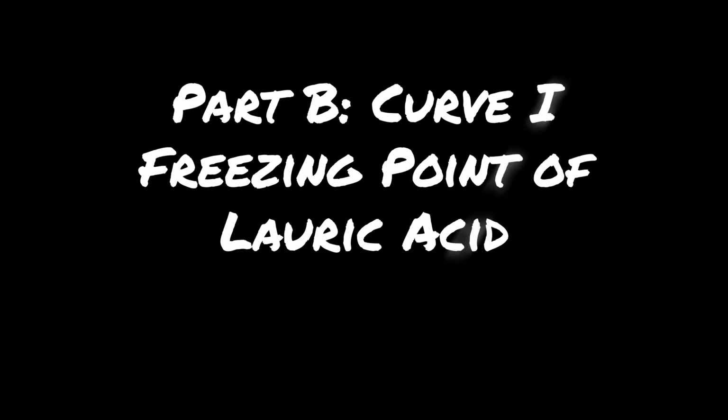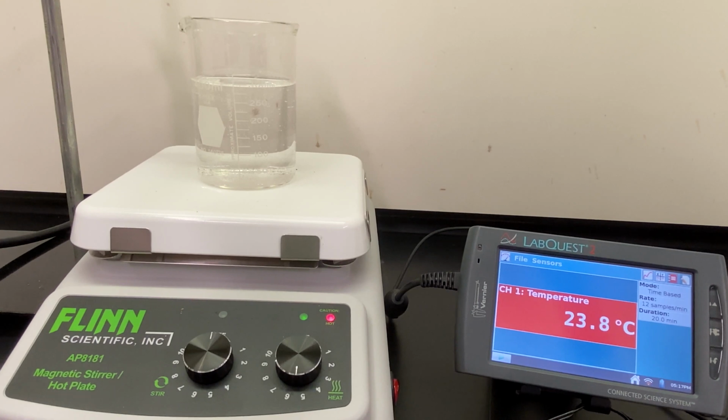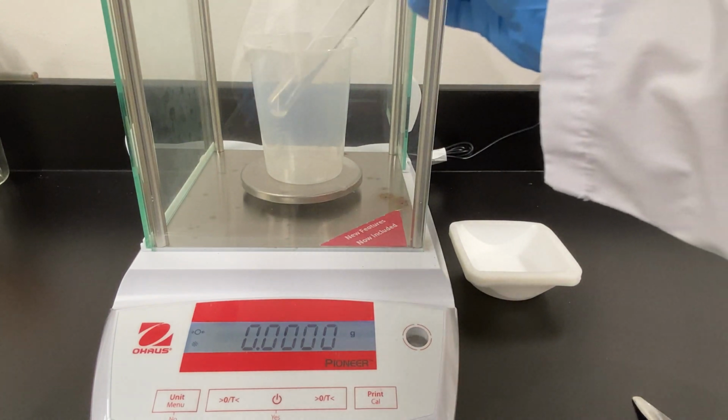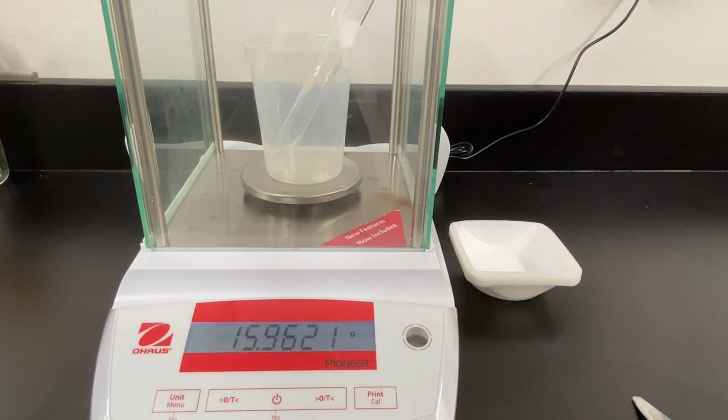Part B, Curve 1, Freezing Point of Lauric Acid. Using a hot plate, heat a beaker full of 300 milliliters of water. Tare a container which can hold a test tube on an analytical balance. Then measure the mass of that test tube on that balance.